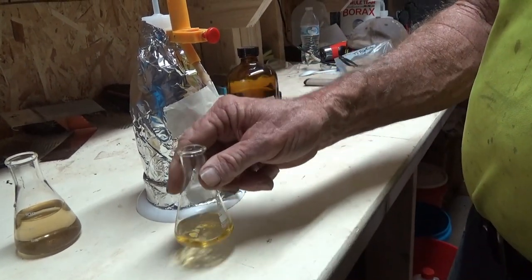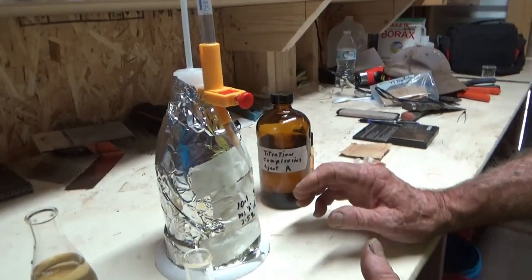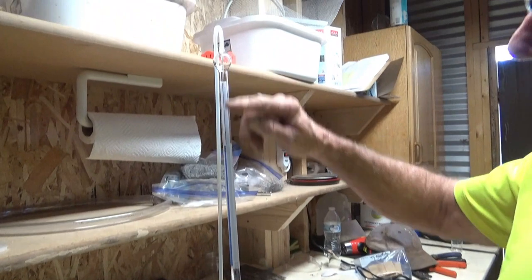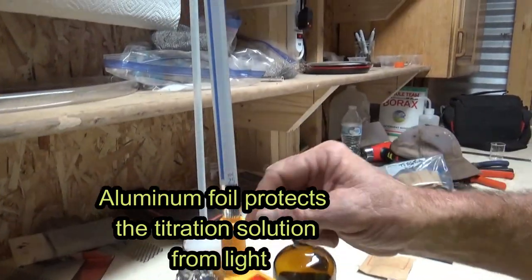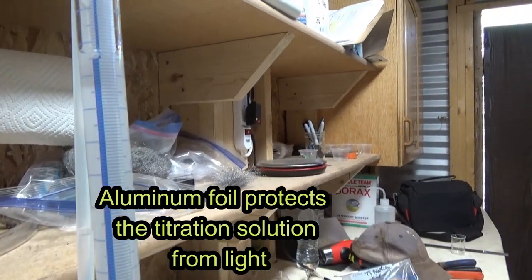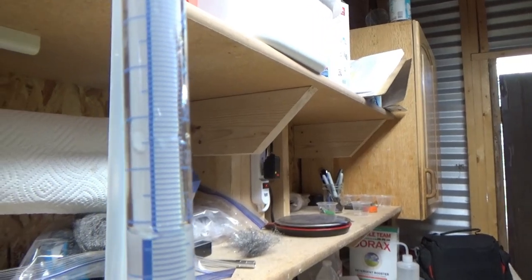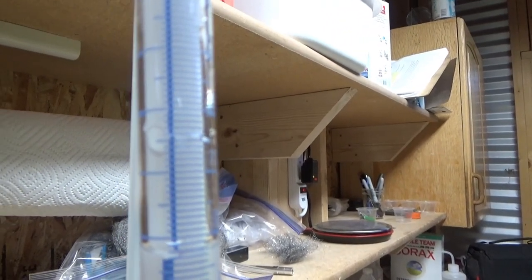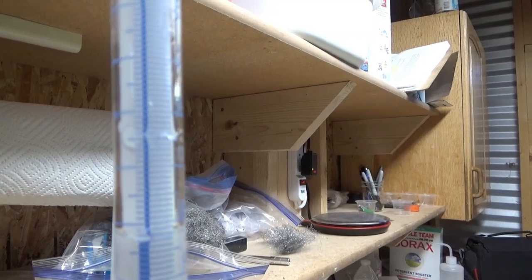Now we're ready to do the titration, but we have to have a special piece of equipment for that. Now this is called a burette. It's basically a graduated cylinder with a little valve on the bottom that lets out a little bit of solution at a time. And you fill it to the zero point and then add to your thing and measure it.